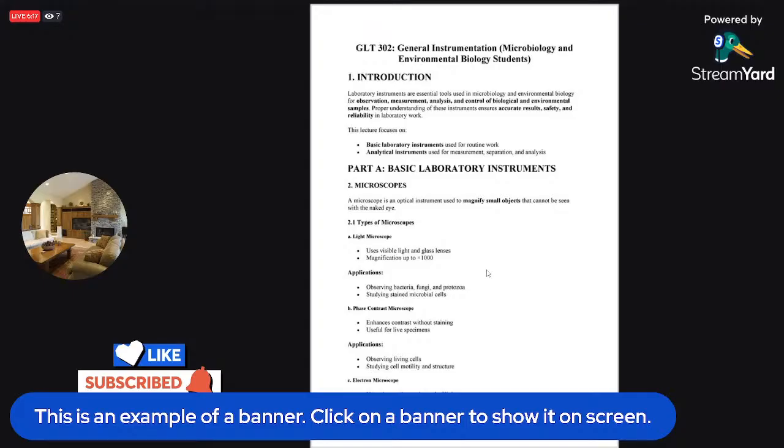And what are the different types of microscope? We have the light microscope, which uses. If you want to write anything for us, even in the exam, I want you to focus on the types, uses, and application.